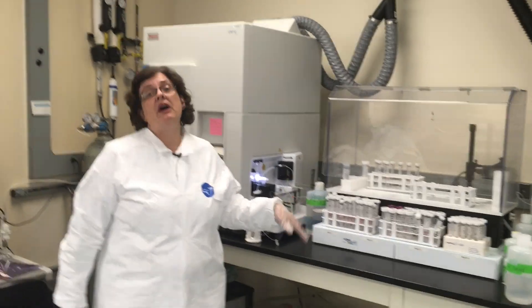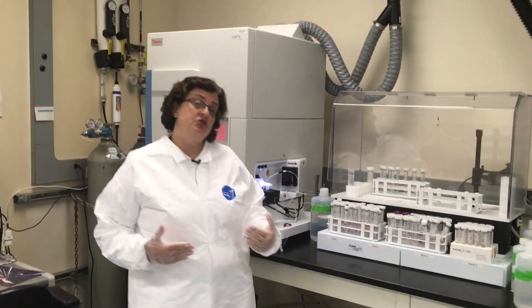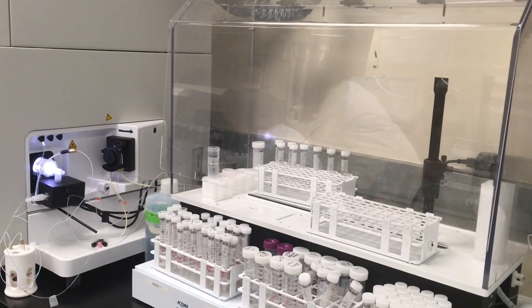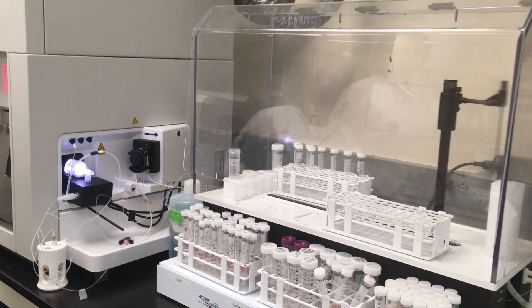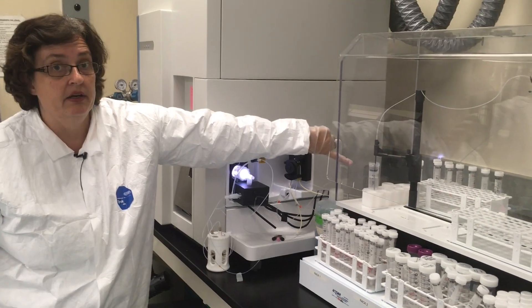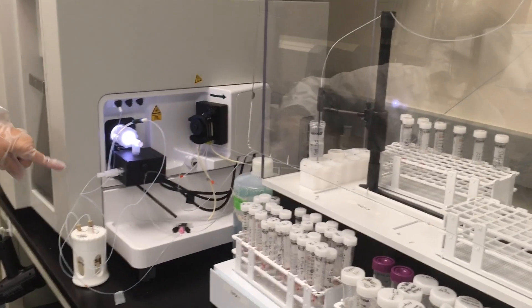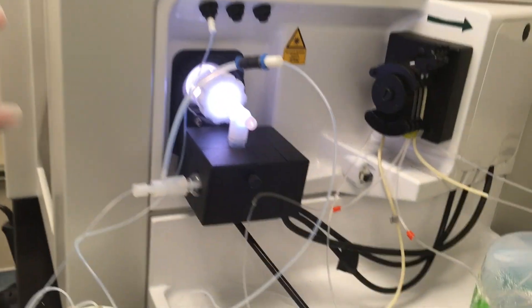I want to talk briefly about how the instrument does the measurements. Basically, you need to turn your sample into a solution and load it into the auto sampler. We get the sample into the instrument by taking it up in this probe right here. It is then pumped into the instrument with this small pump, and it goes into the nebulizer, then into a torch and a plasma.